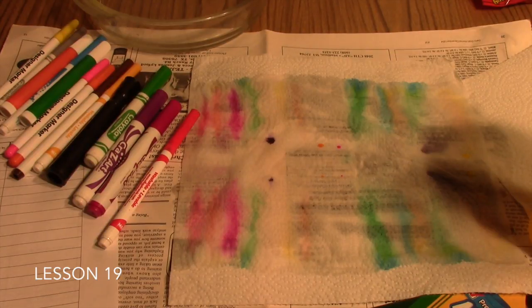So this is the chromatography lab, which goes with lesson 19, where we are analyzing various chemical compounds. In this lab, we looked at various solvents that a person might use to separate different compounds. Enjoy your time with your students in this fun laboratory.